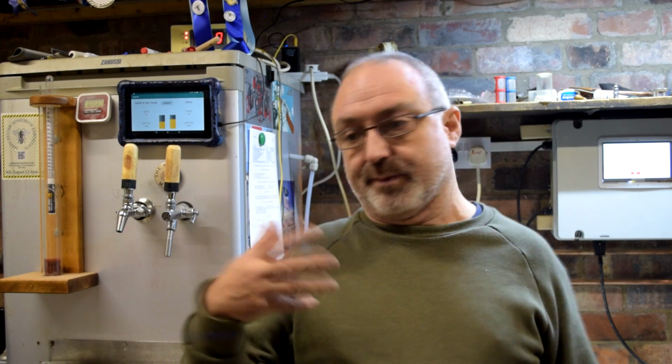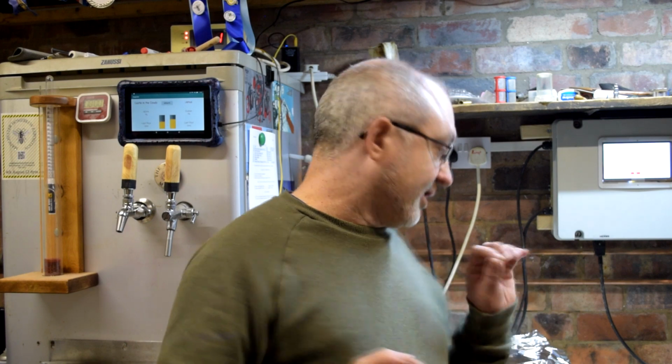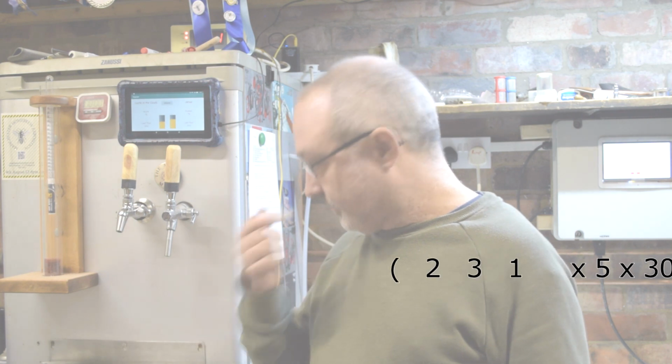So we need to start doing some maths. We multiply that up by 5 to go for all the cells in the grid, and then we need to multiply it up for the dilution rate, so by 30, and by the size of the cell relative to the sample. So I'll go and do that maths, and then I will show you the numbers.